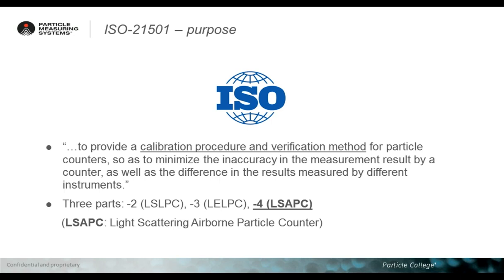So the goal of this standard is really to harmonize the calibration procedure, the calibration methodology, and the standard used to adjust your instrument's counting performance, to a unique and universal method.